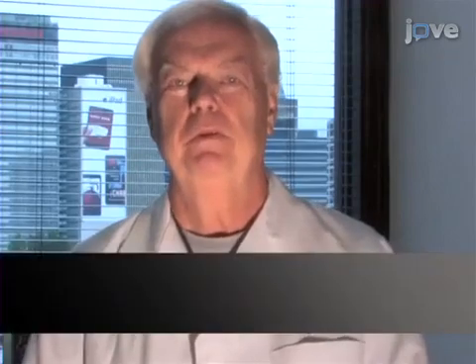Some years ago, we noted that there was not a good method to measure orofacial pain in an animal model. This led us to explore the possibility that meal pattern analysis could be used to measure orofacial pain. This led to the development of the model that we've utilized today to measure orofacial pain.